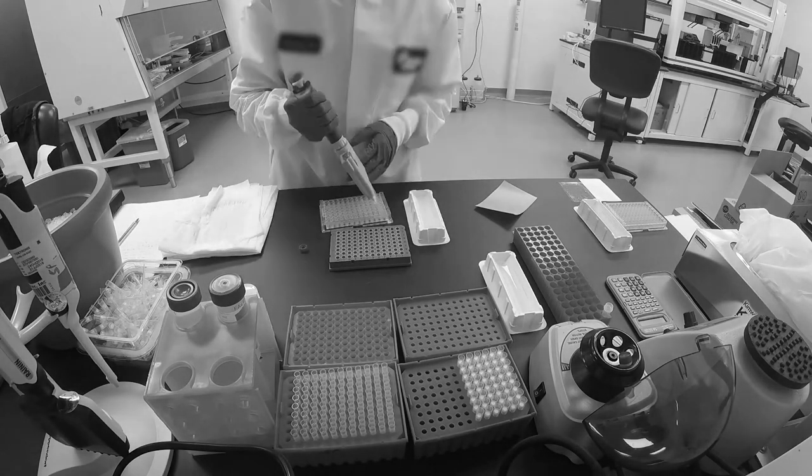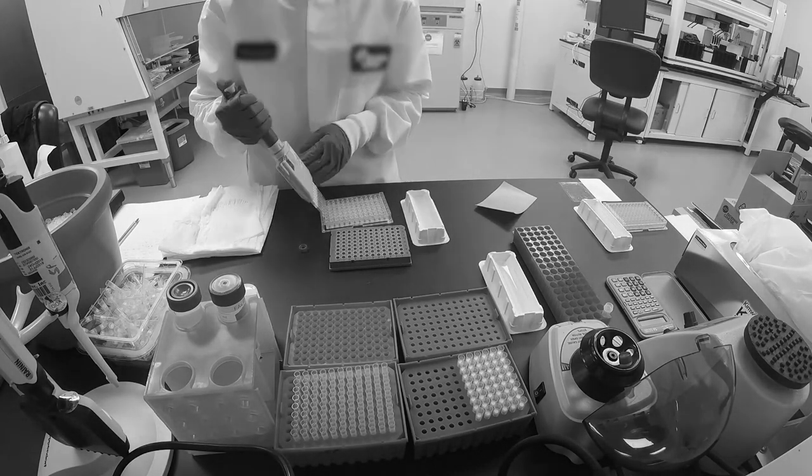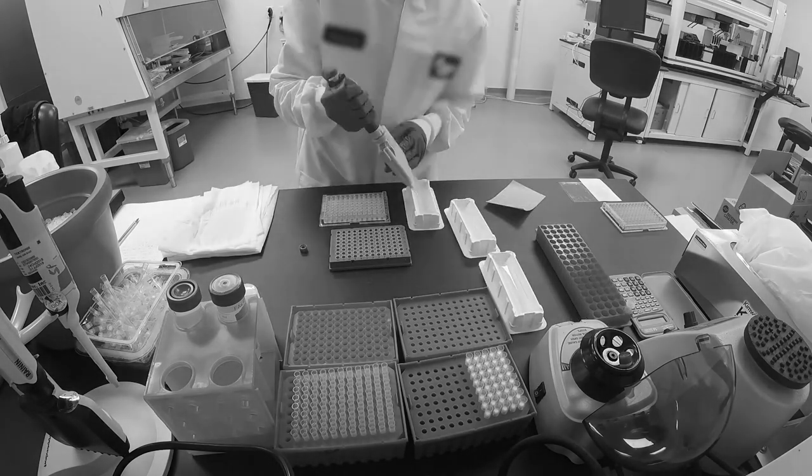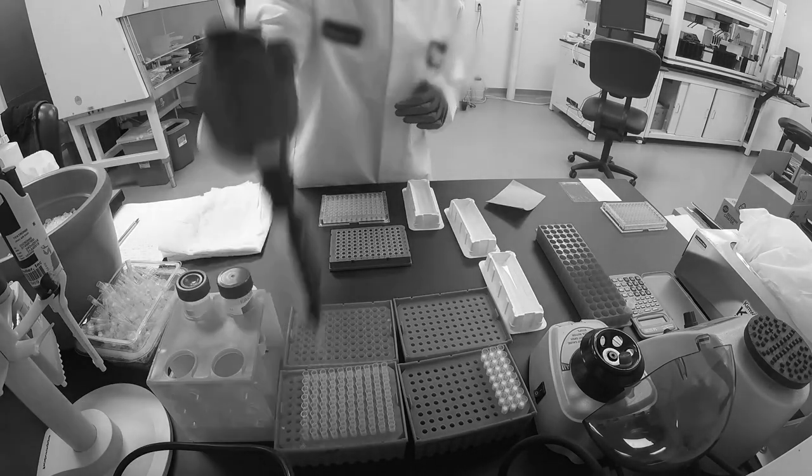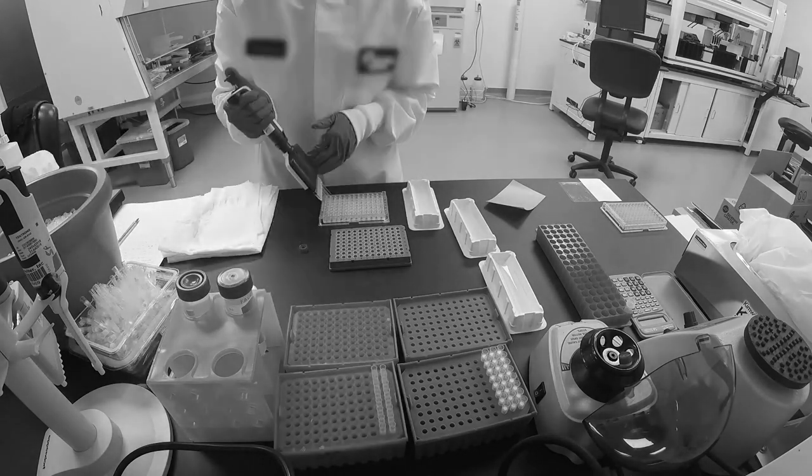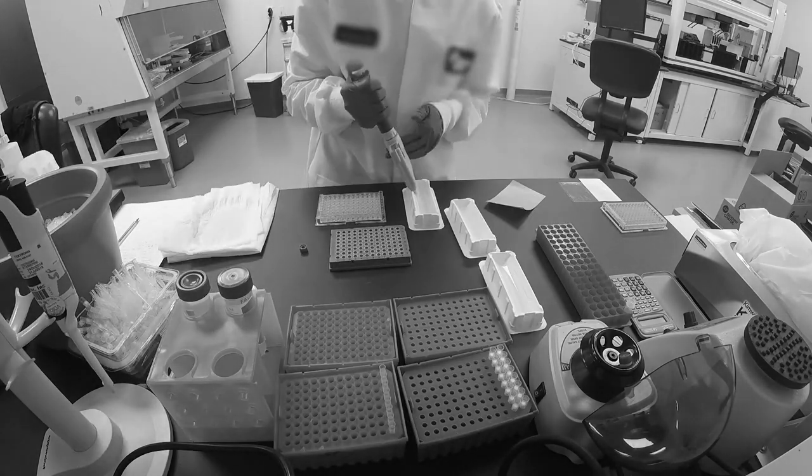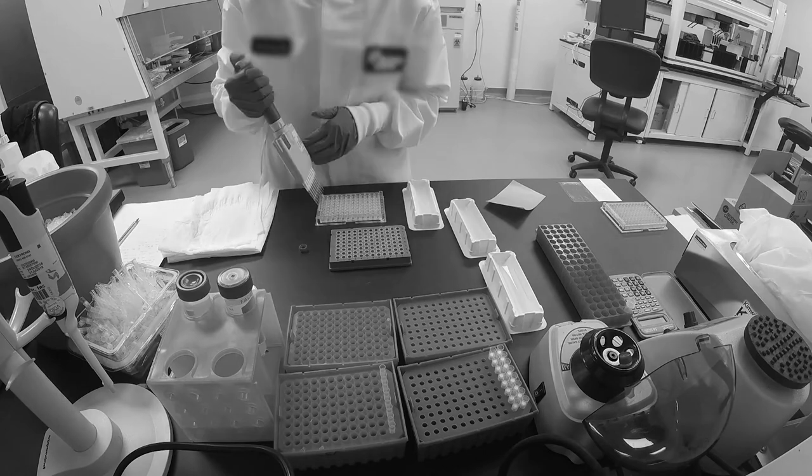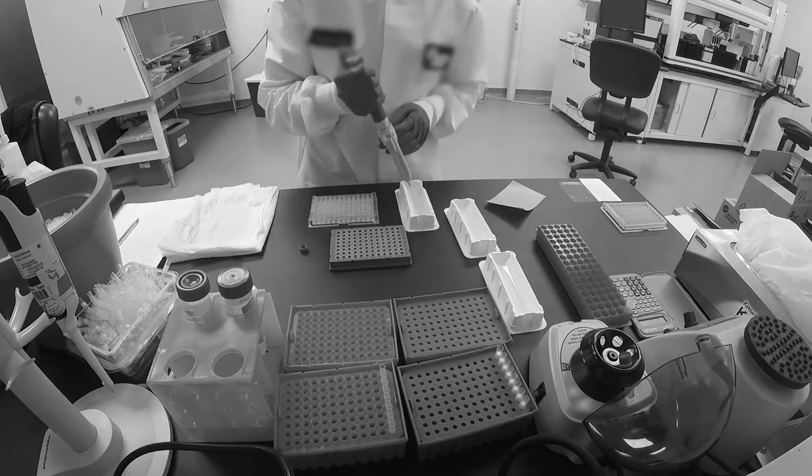How many times have you struggled with setting up your ELISA? For decades, ELISA has been one of the most popular methods to detect biomolecules. However, it is still a time-consuming, pipetting-heavy assay that requires tight control on pipetting precision and sample processing, as a slight mistake can invalidate your results.